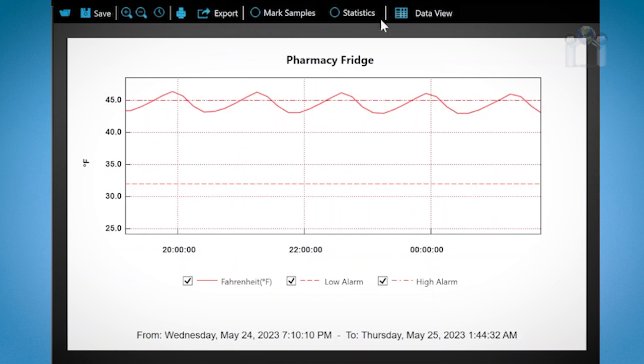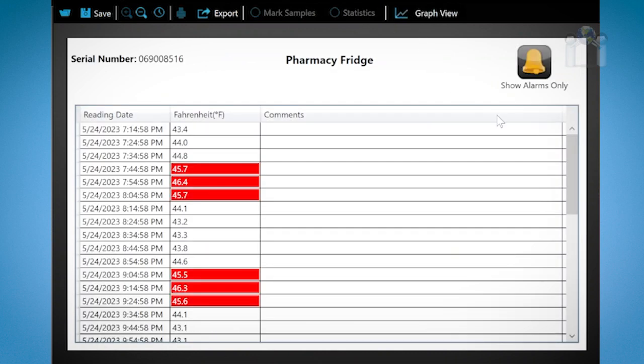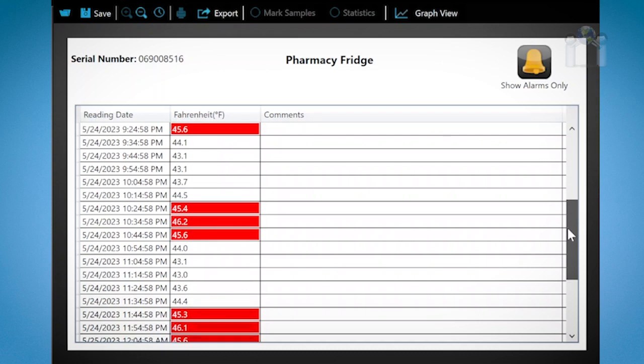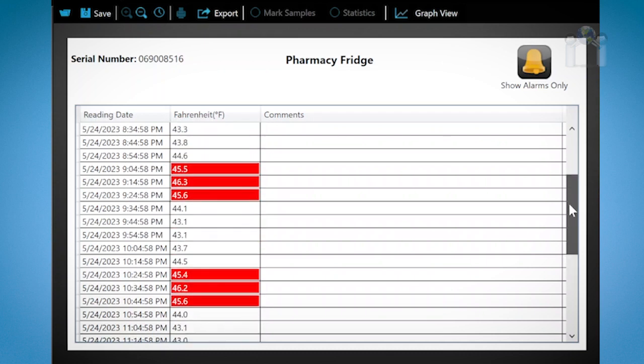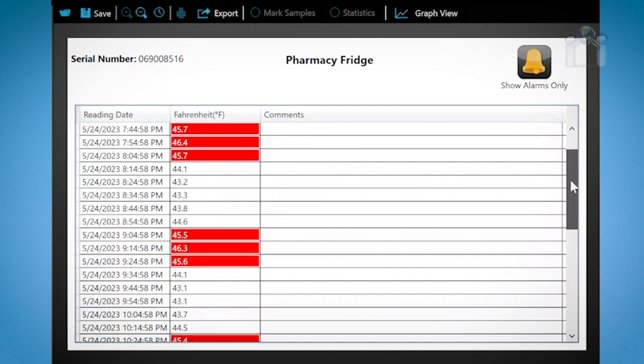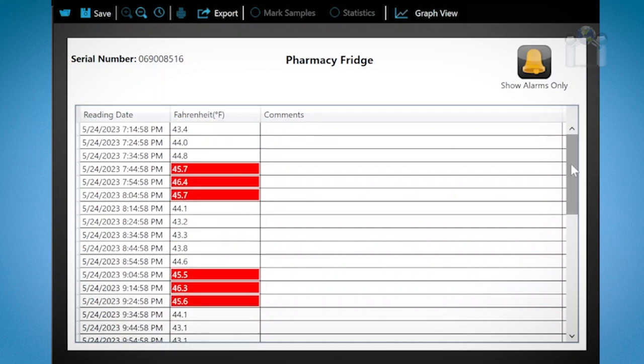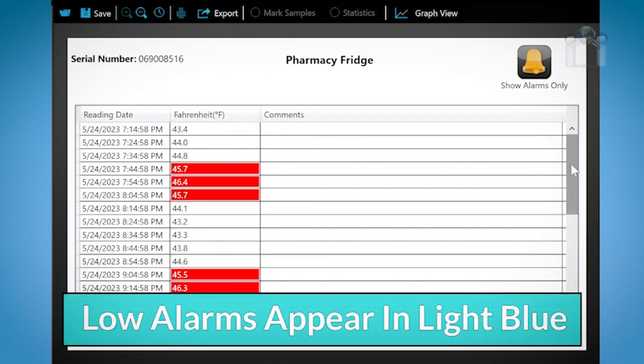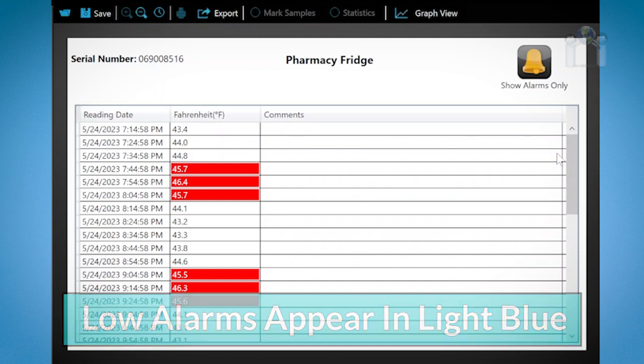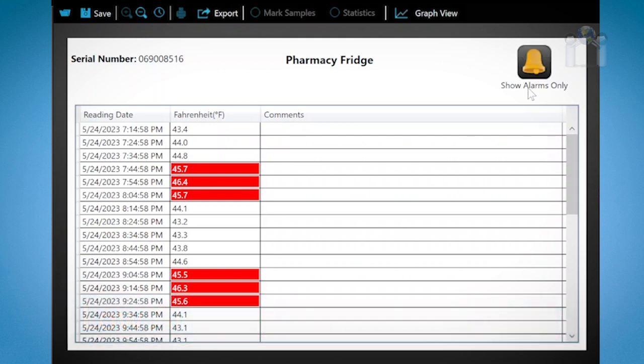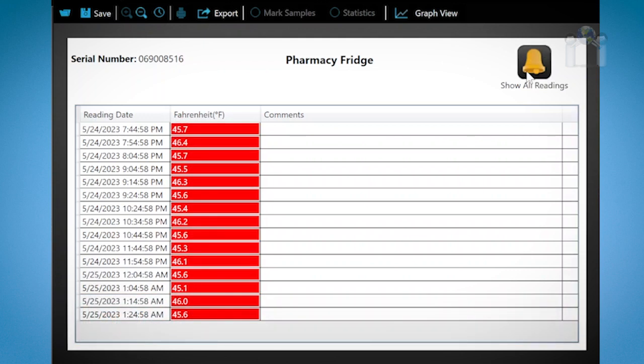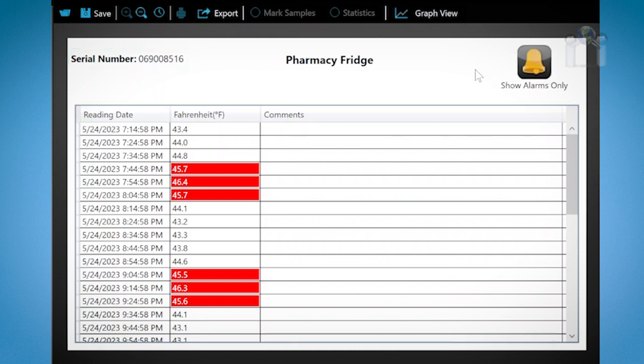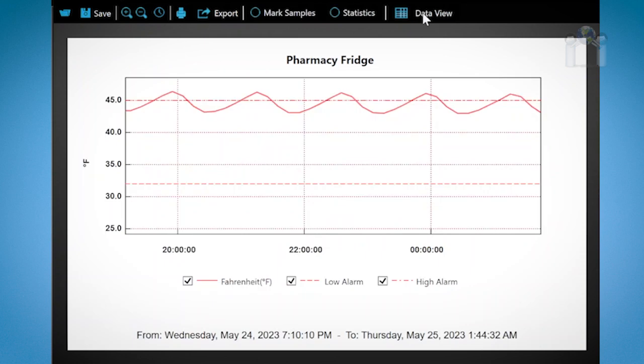Click on data view and you will see the data in a text view instead of a graph. You will see that some temperature readings are in red which indicate a high reading and some are in blue which indicate a low reading. If you wish you can click on the icon show alarms only in the upper right corner to view the alarm readings. Click on it again and the alarm readings will return. You may have also noticed that the data logger serial number appears on this screen. To return to the graph click on graph view.